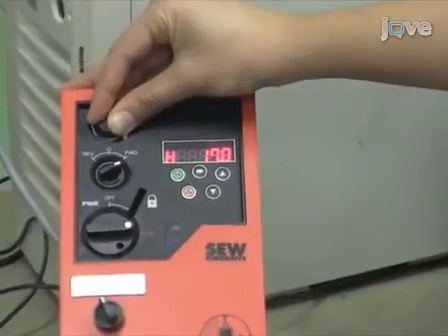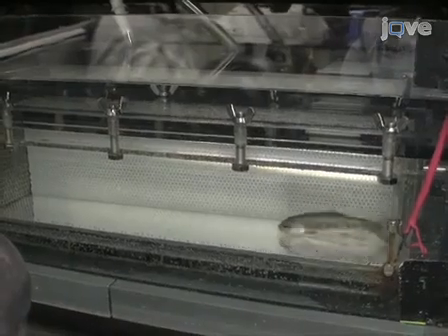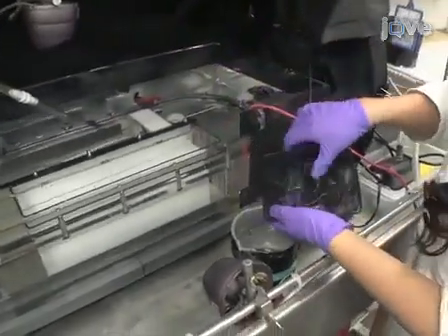To capture burst swimming or sprint ability, bring the flow speed to an estimated maximum. Fish should be resting at the rear of the chamber as the flow speed is rapidly increased. Once fatigued, fish should be allowed to recover or removed immediately for tissue sampling.